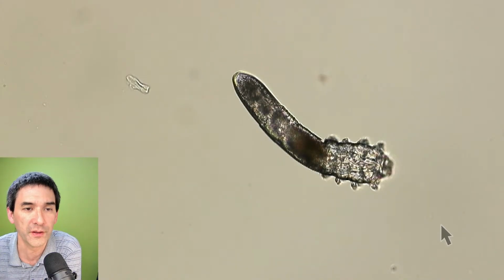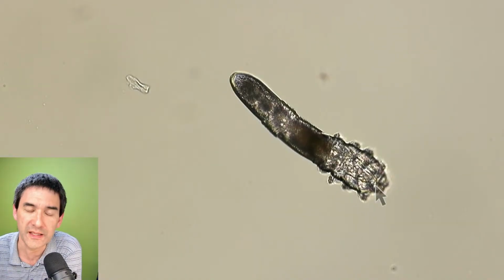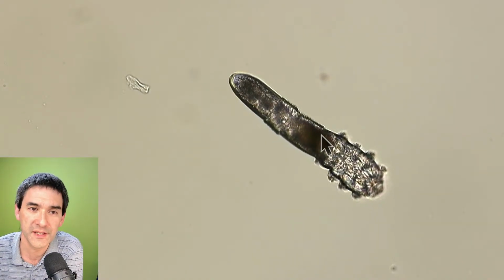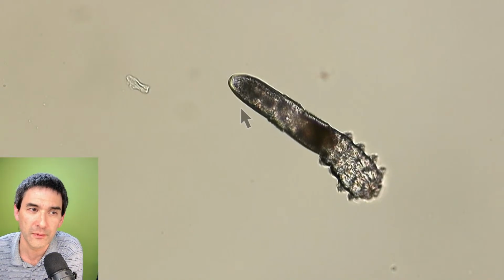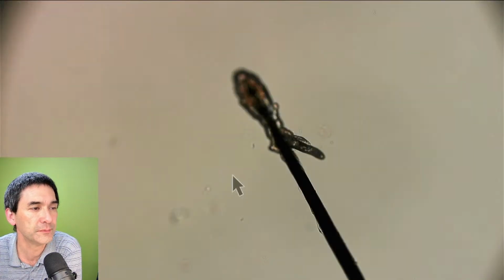Okay, so far nothing unusual. This is just nice because it's a top view and you can actually see the 8 legs. You can see it's a little bit segmented, those tiny lines here. Okay. So, and video 2.